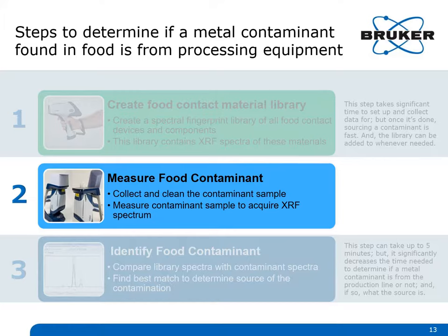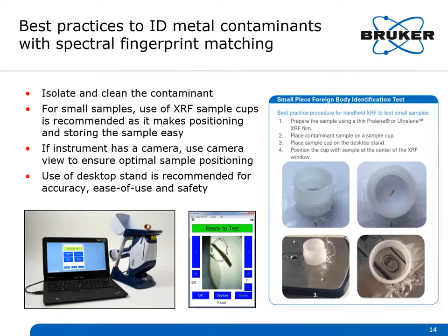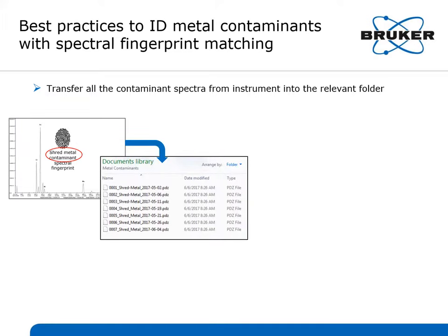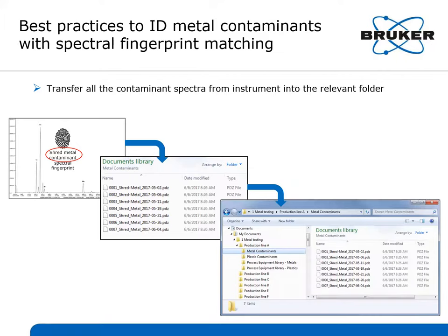The next stage is to test the found contaminant, which just takes a few moments. You isolate and clean the contaminant; if it's a small one as pictured, it's recommended to sandwich the sample with thin film and place it in an XRF sample cup. Using the handheld XRF in a desktop stand, place the sample cup on the analyzer window — the integrated camera helps assure positioning. The PC software that comes with the handheld XRF controls the instrument; simply close the cover and select start to get results. Once data is collected, name the contaminant and transfer its spectra to the correct folder in your production line library.